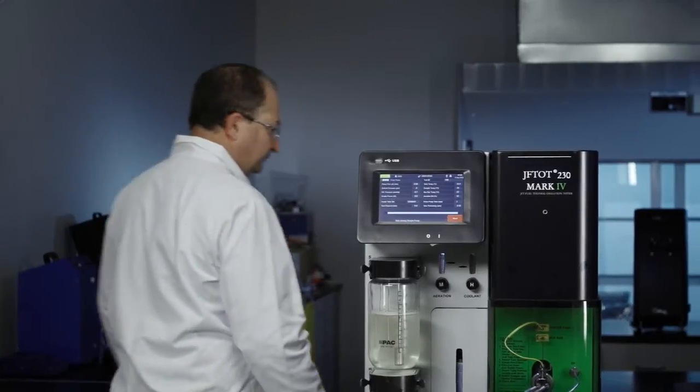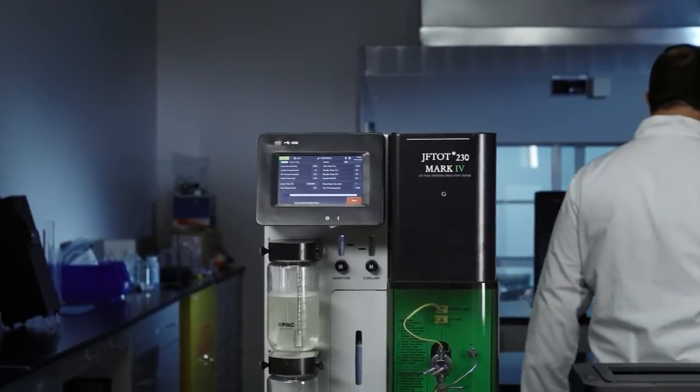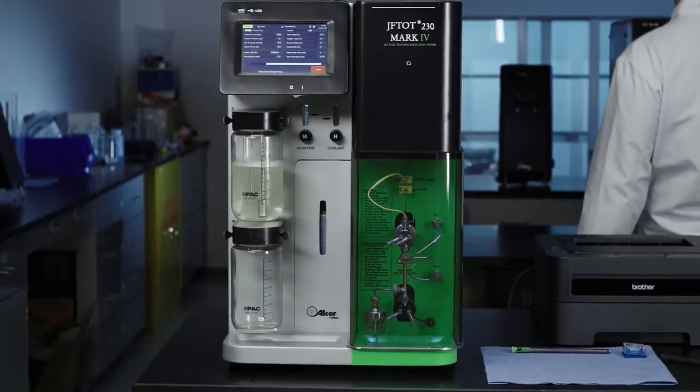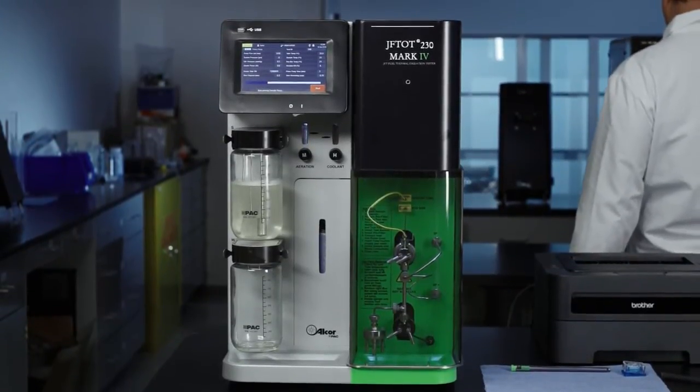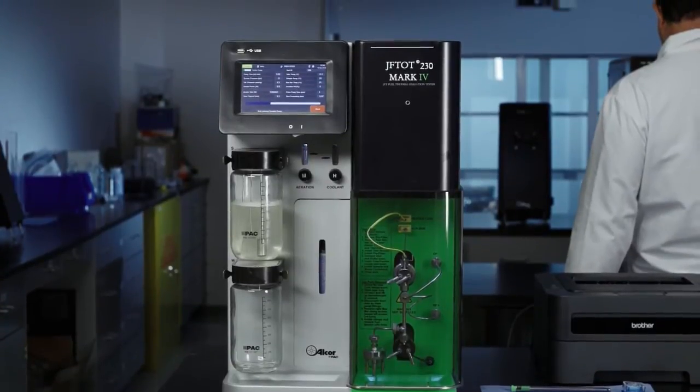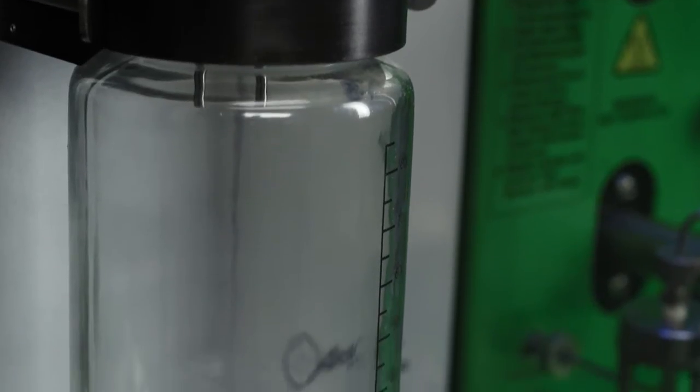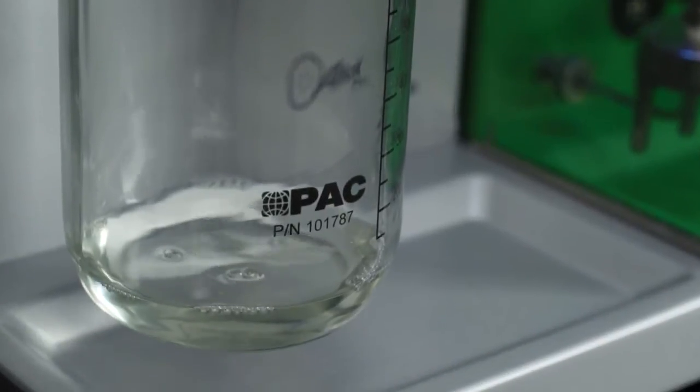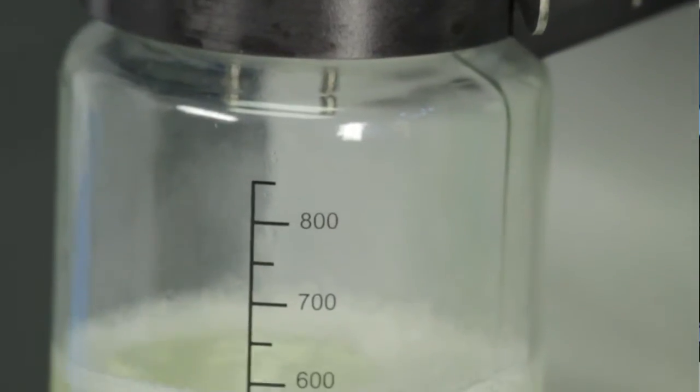One of the features that's different in the new JeffTot is that you no longer need to be in front of the unit. It will run automatically to the end of the test. Once the test is complete, the fuel in the lines of the test section will automatically be flushed out to keep the jet fuel from leaking out of the lines when you take the instrument apart.